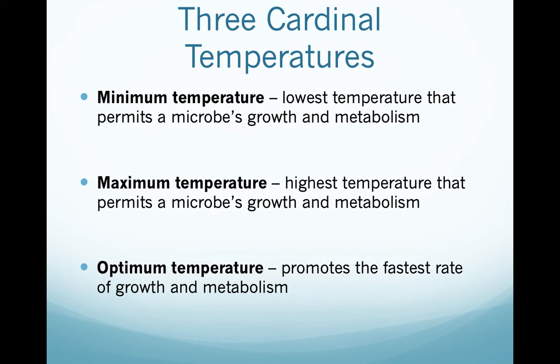So one of the main things to talk about when growing bacteria in a lab, causing infections, or finding bacteria in the environment is temperature. Temperature is one of the most important things in the world of microbiology. Growing bacteria in a lab usually requires an incubator, and that incubator is designed to replicate the bacteria's optimum growth temperature right here.